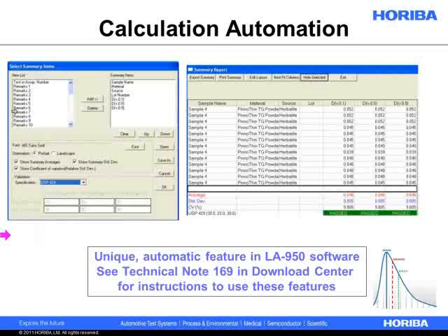And with the 950 software, we've given some tools to automate how we calculate the coefficient of variation values, so automate the suitability of certain procedures. So in the 950 software, we have an ability to, let's say, pull up the USP 429 guidelines and then give you a green pass or fail. So in this case, I don't know how many measurements this is, probably 10 or something like that. It automatically calculates the average for D10, D50, D90, and then calculates the coefficient of variation on each.